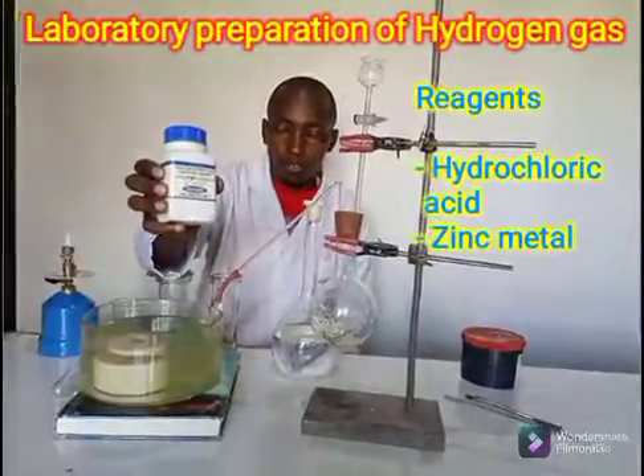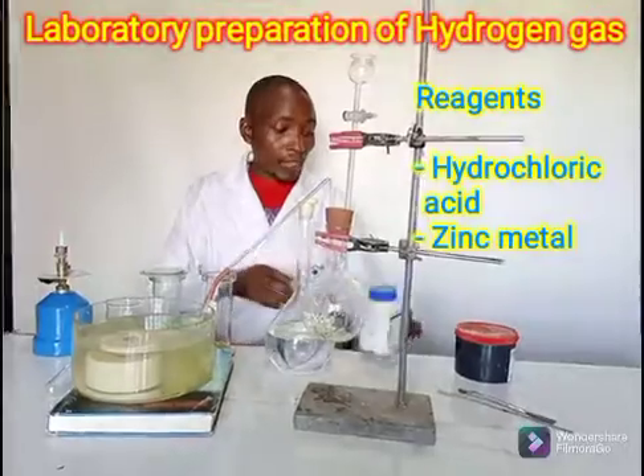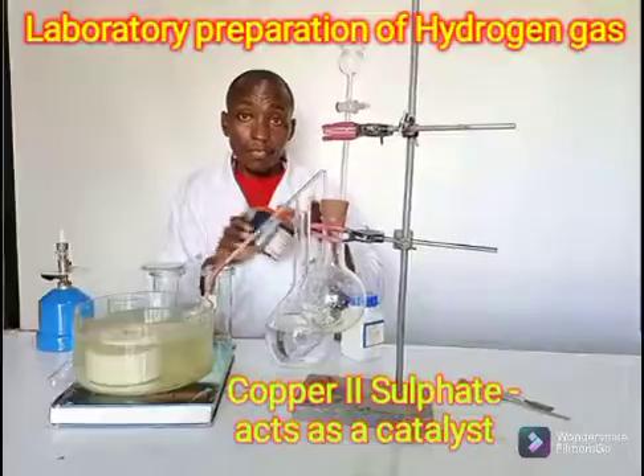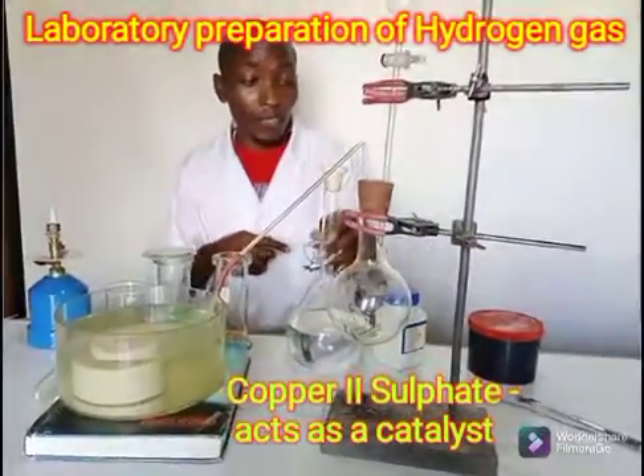This is zinc metal. And in addition I will use copper sulfate — this will be my catalyst. It will help to speed up the reaction.